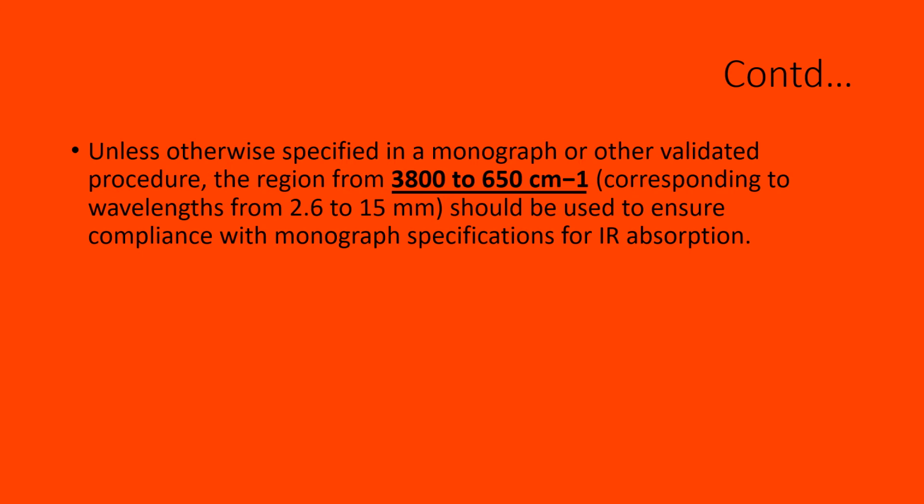Generally, the scan would be between 4000 and 400 cm⁻¹, but the range required is between 650 and 3800 cm⁻¹ for routine use.